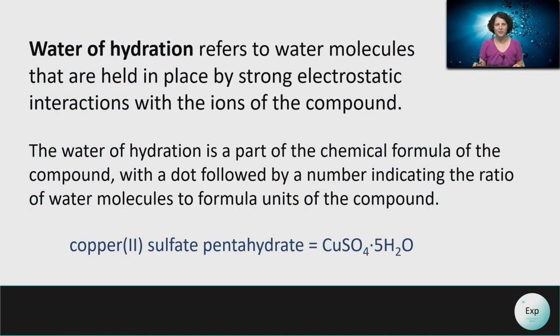My name is Dr. Esther Trufan, and in this video, I will be talking about waters of hydration and how to calculate them from experiments that require evaporating waters of hydration from a hydrate. Waters of hydration are typically water molecules that are held in place inside a crystal lattice by strong electrostatic forces between the water molecules and the ions from the ionic compound.